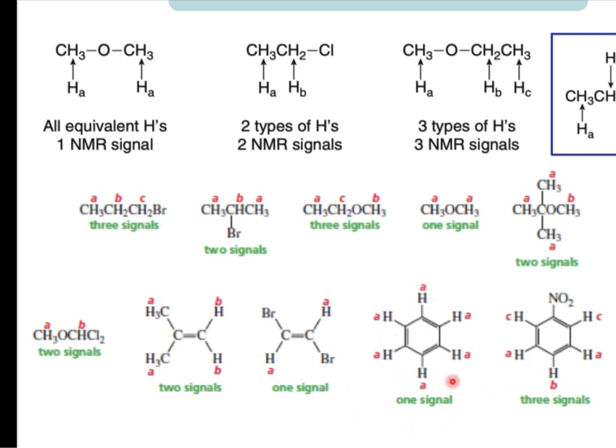This one is an aromatic compound, which is benzene. All protons are equivalent protons. All have the same chemical environment. That's why it has one signal.